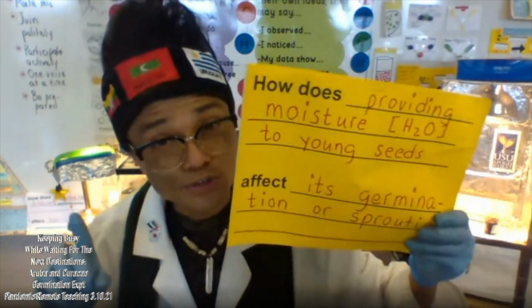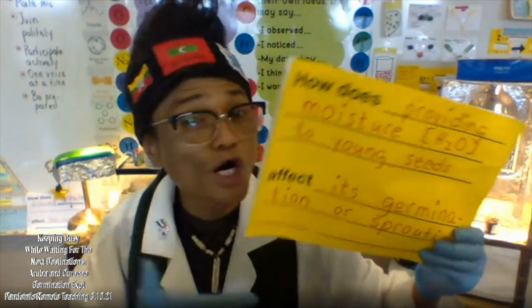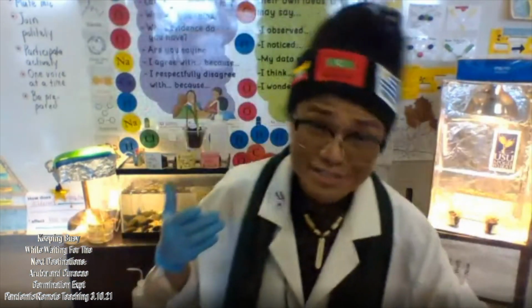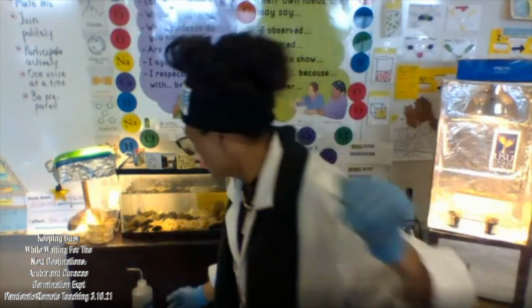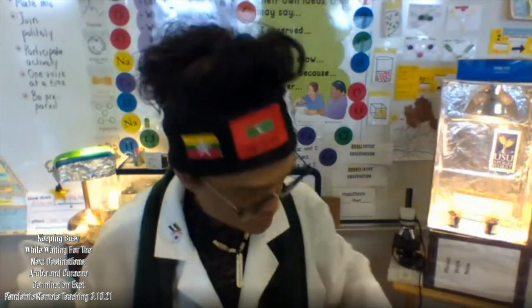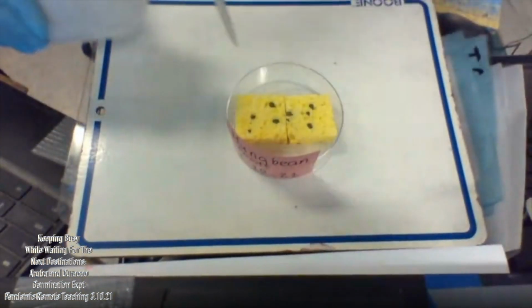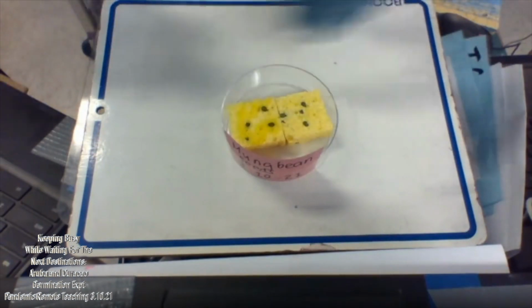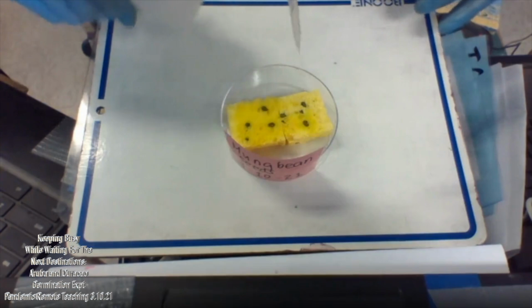right? The moisture. Of course, we will not see magic here. We're gonna be patient in order to see some results. Okay, it's very simple. I do have the water here, and I don't need this anymore. Let me shortly focus the camera. So what I need to do is to just make certain that this is moist.